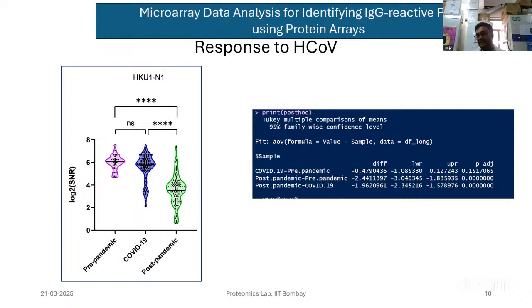Because the data is already normalized. But we have not stopped there. We have imposed two further filters, where we need to check the variance as well as a normality test. So these two tests could be done, and then only we take the call either to go ahead with the ANOVA or not, because there are other strategies, like the Kruskal-Wallis test. If you are not okay with the normality, the researcher could take the call to go ahead with Kruskal-Wallis as well. But here you can see we have gone ahead with the ANOVA.